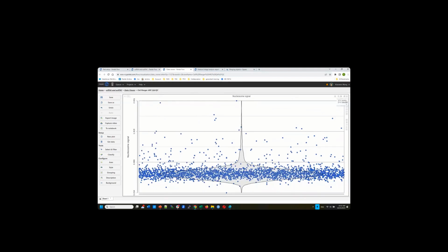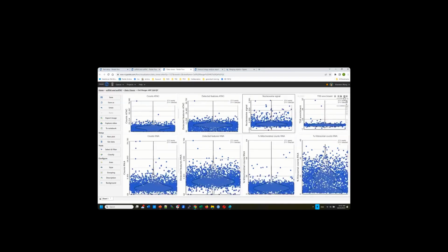But as you do the QC, when you do the filter, you should always look at your distribution. I can see they are less than around, I would say, 0.6 or 0.7 in this area. Okay, so always use your data to perform the filter.